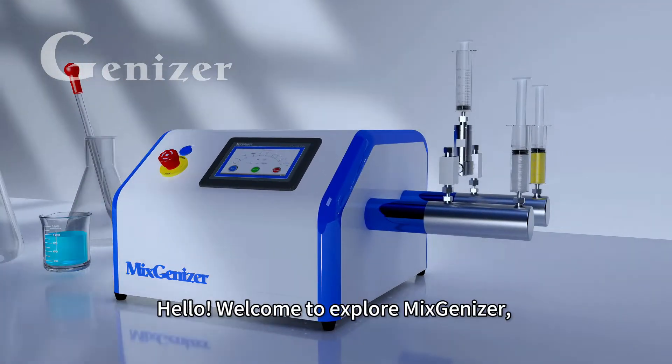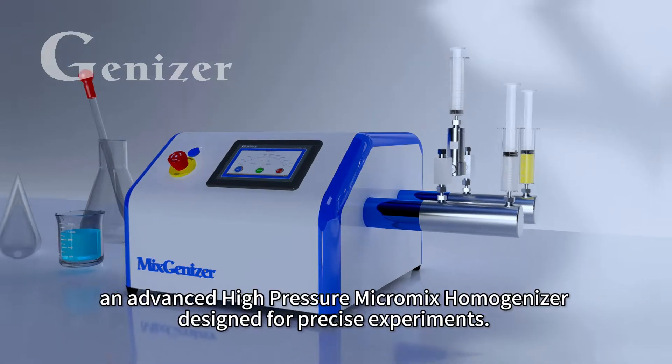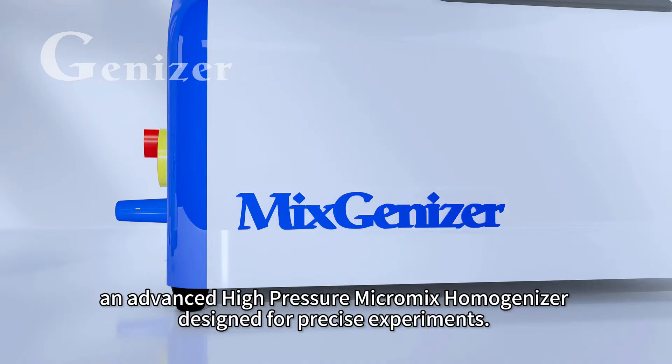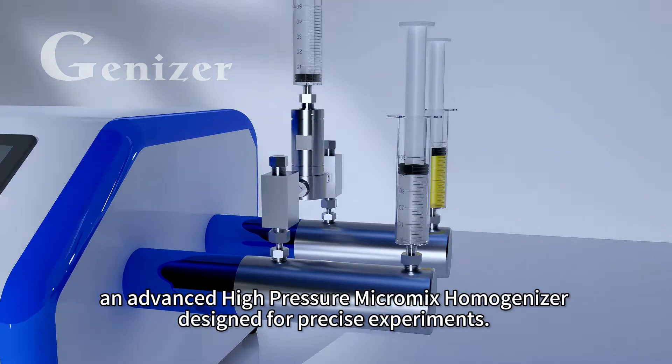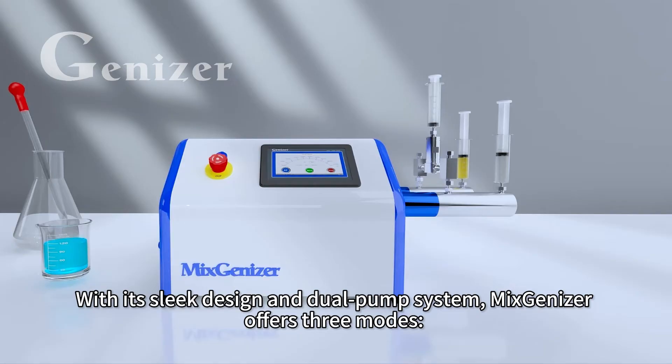Hello, welcome to explore MixGenizer, an advanced high-pressure micromix homogenizer designed for precise experiments. With its sleek design and dual pump system, MixGenizer offers three modes.